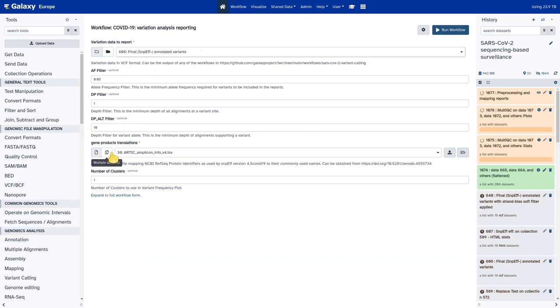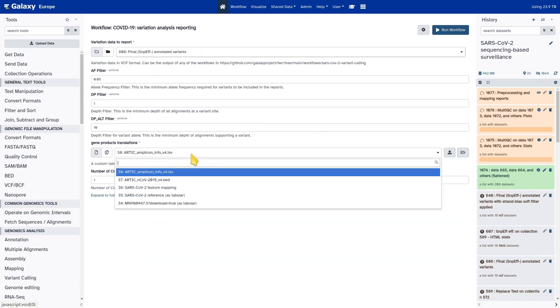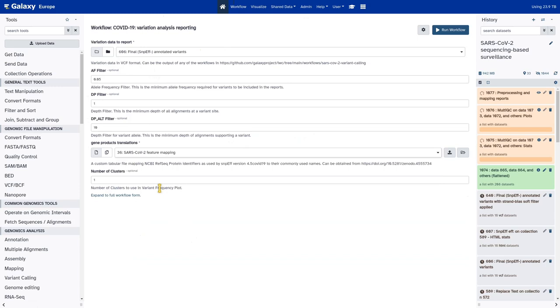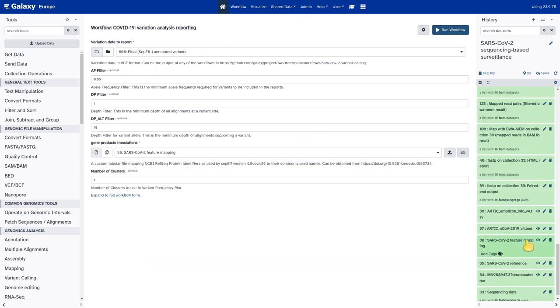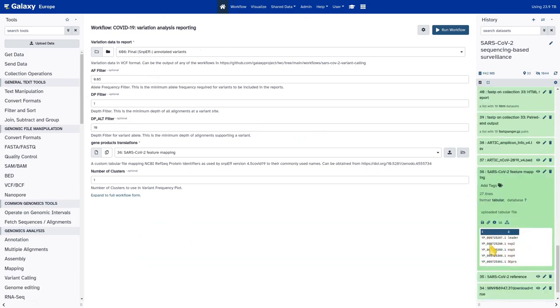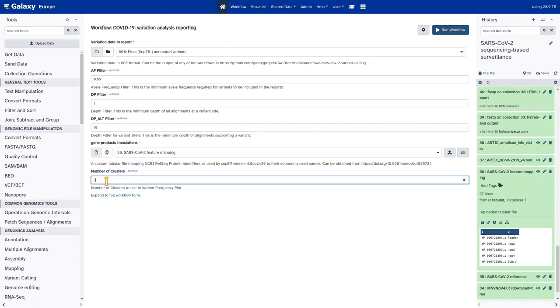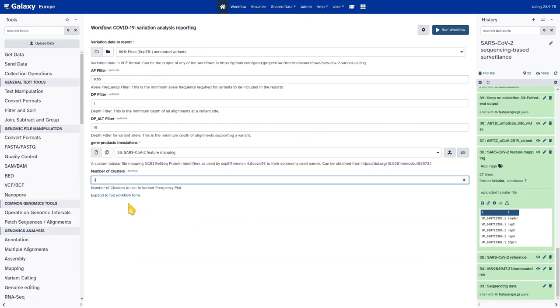We can leave all the filters at their defaults. For the gene products translation file, that's the feature mapping file we uploaded initially. Galaxy auto-selects another tabular file — the amplicon info — so we have to correct this and choose the SARS-CoV-2 feature mapping file. This file will be used by the workflow to produce more readable names for the different genomic features of SARS-CoV-2 in those reports. Then we're setting the number of clusters to three, which will affect the variant frequency plot — the major plot produced by this workflow. It tells the workflow how many clusters to consider as main clusters when doing hierarchical clustering of the samples based on their mutation profiles.